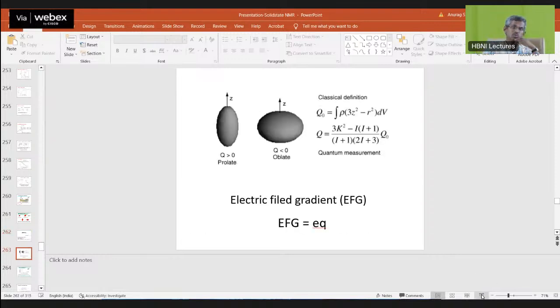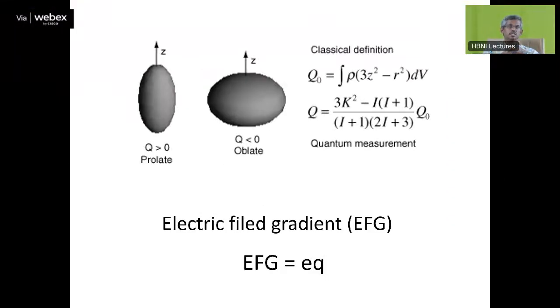So let us try to discuss a small portion of solid state NMR. Of course, many things are to be taught, but let us discuss some important aspects. I will briefly discuss the quadrupole NMR. Normally, people may not do much quadrupole NMR in solution, because carbon-13, proton, phosphorus-31 and nitrogen-15, which are all spin half nuclei, already give good information. But in solids, around 70 to 80% of the periodic table consists of quadrupole nuclei, so in solids we are very much interested in quadrupolar nucleus NMR.